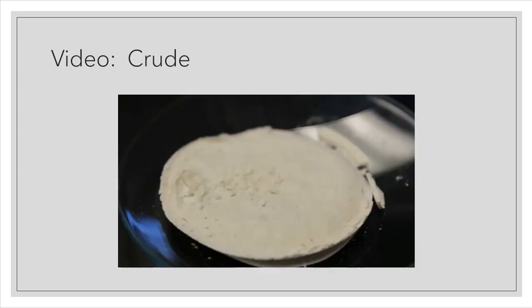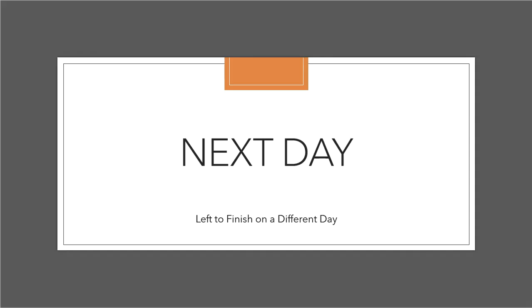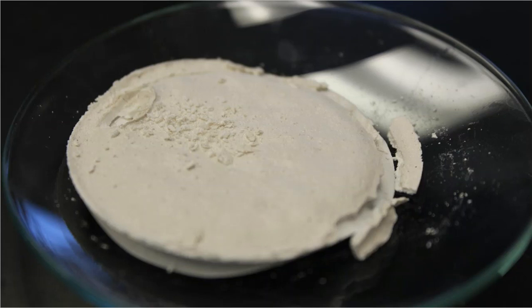All right, folks, so as bad as I hate to say it, I'm not quite yet done with the lab. Can you believe it? You probably can. So the next day, I came back in, and I went back to that crude product. It didn't look any different after I let it sit overnight. And now I need to recrystallize this product to make it pure.